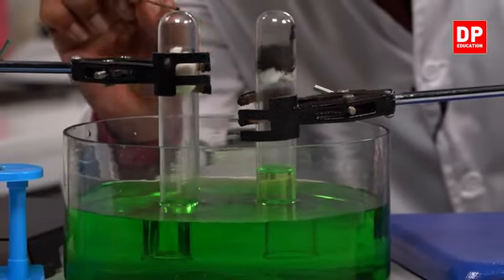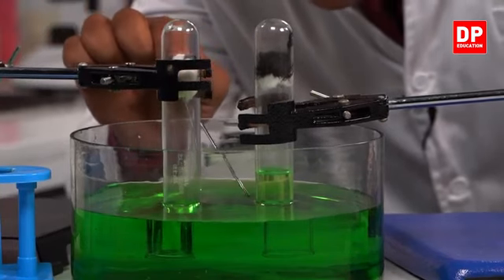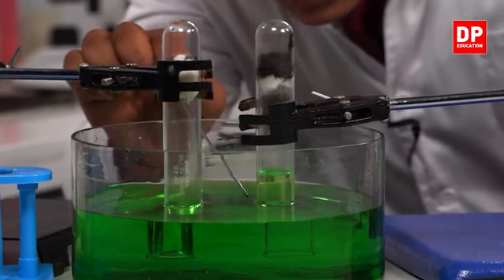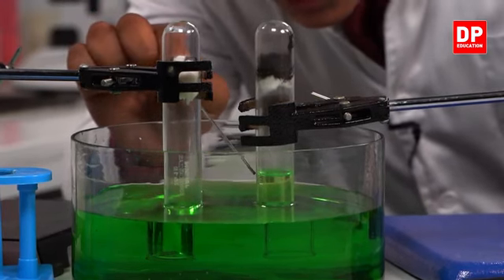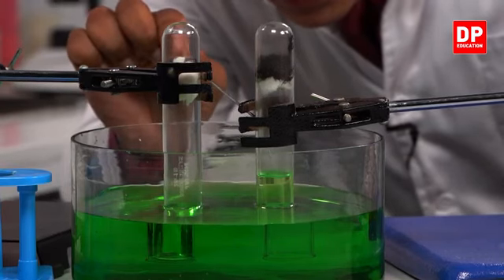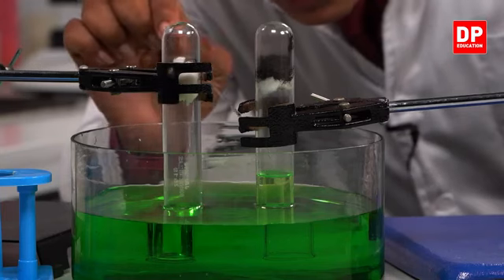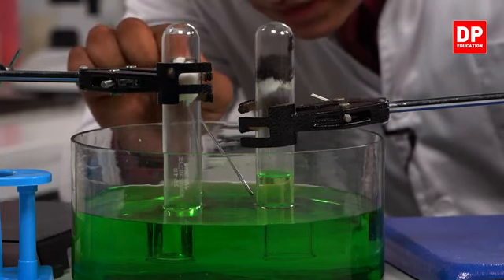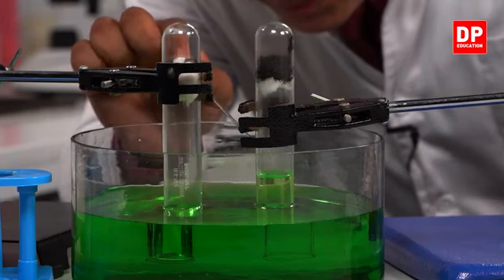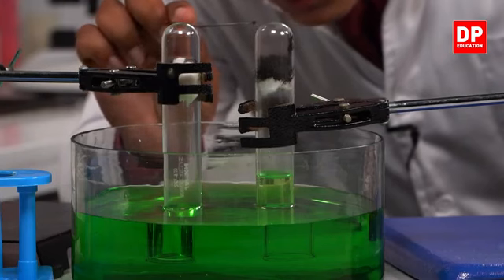So here to here, and this smaller part which the water has risen up. We'll see how many parts there are. Here to here, 1, 2, 3, 4 and 5. Once again, 1, 2, 3, 4 and 5.